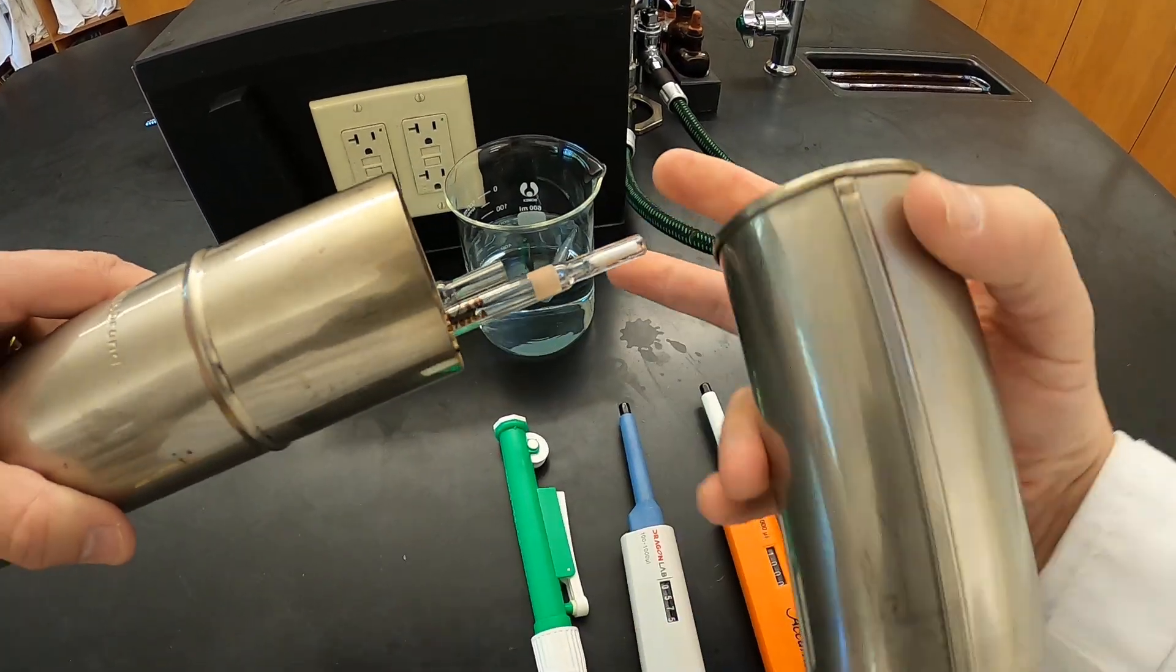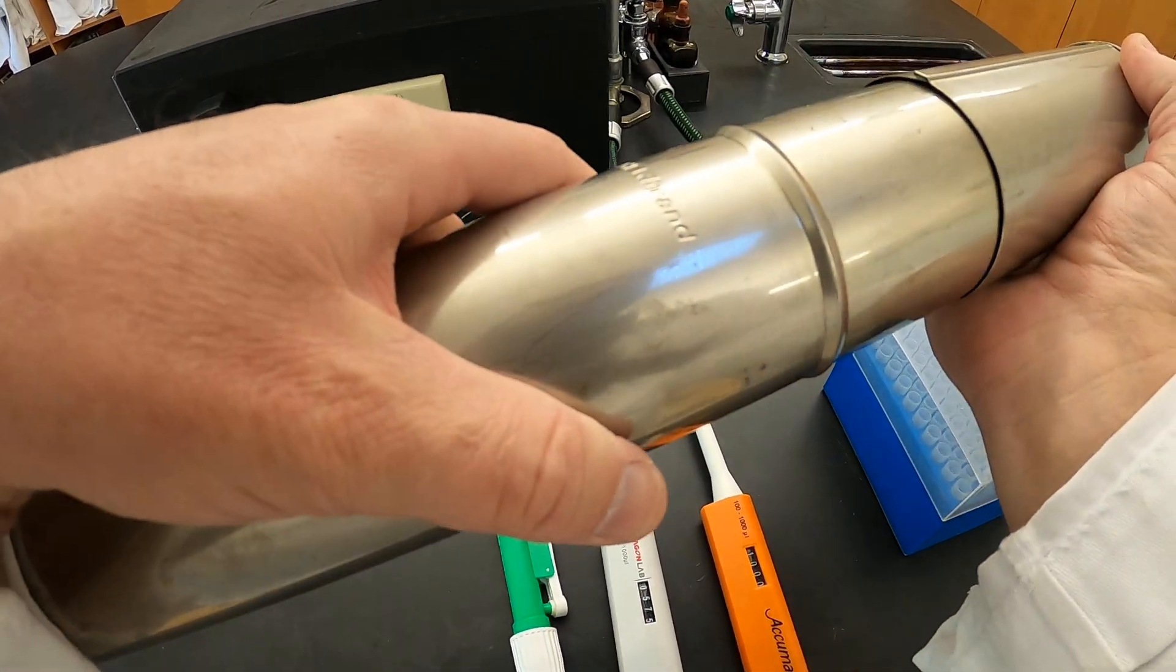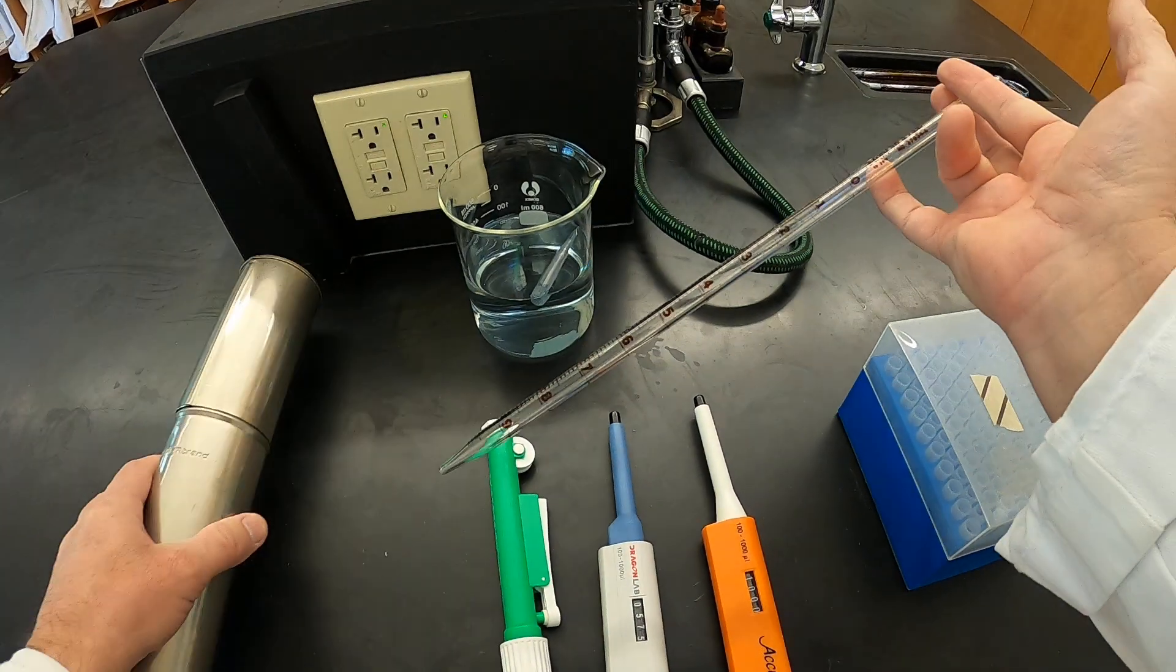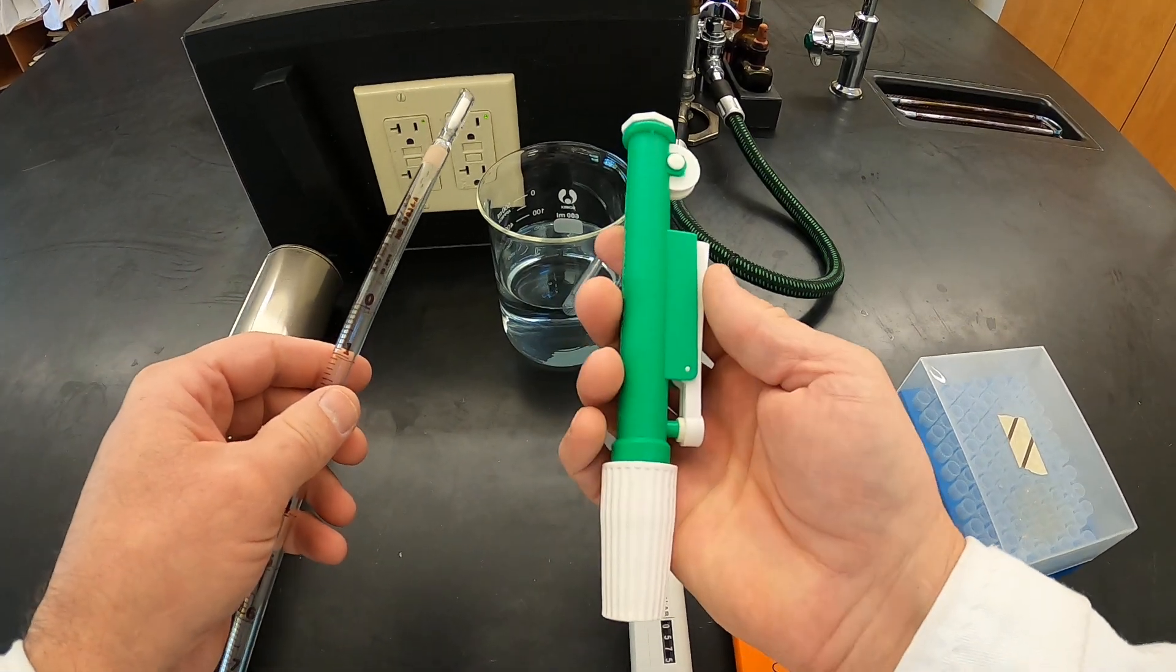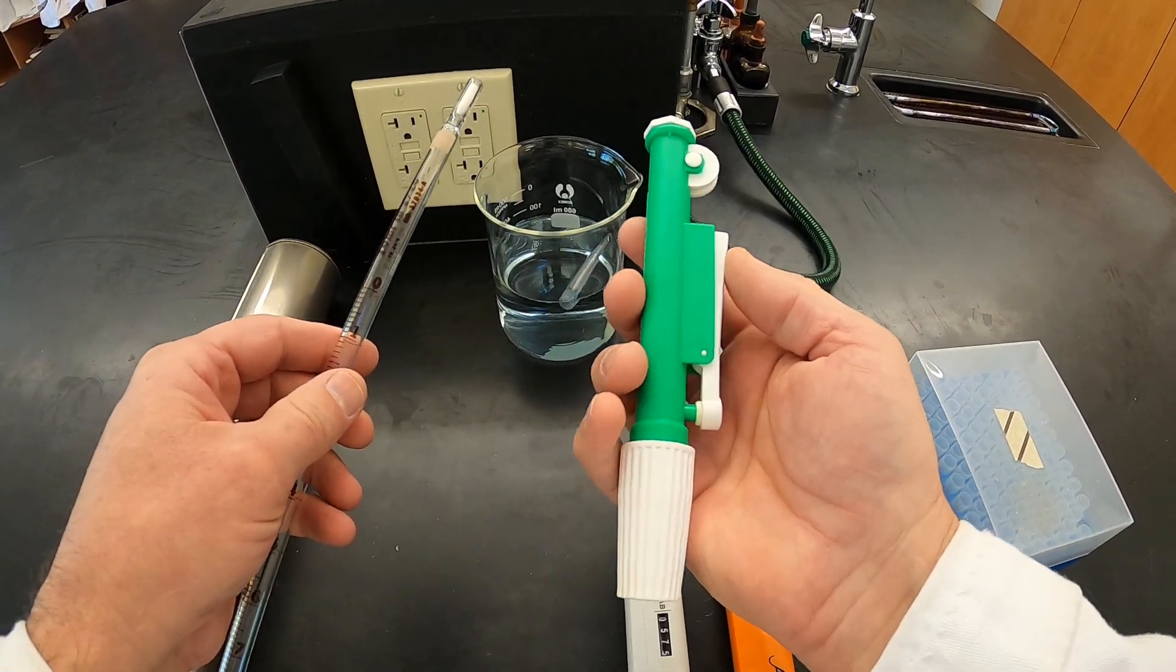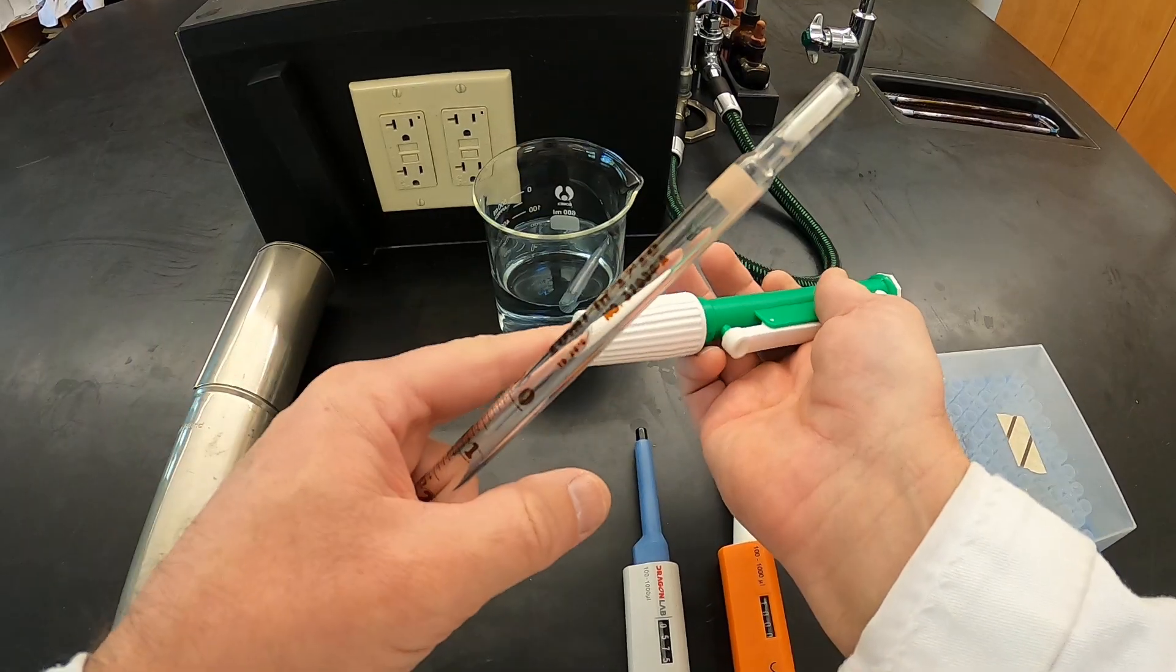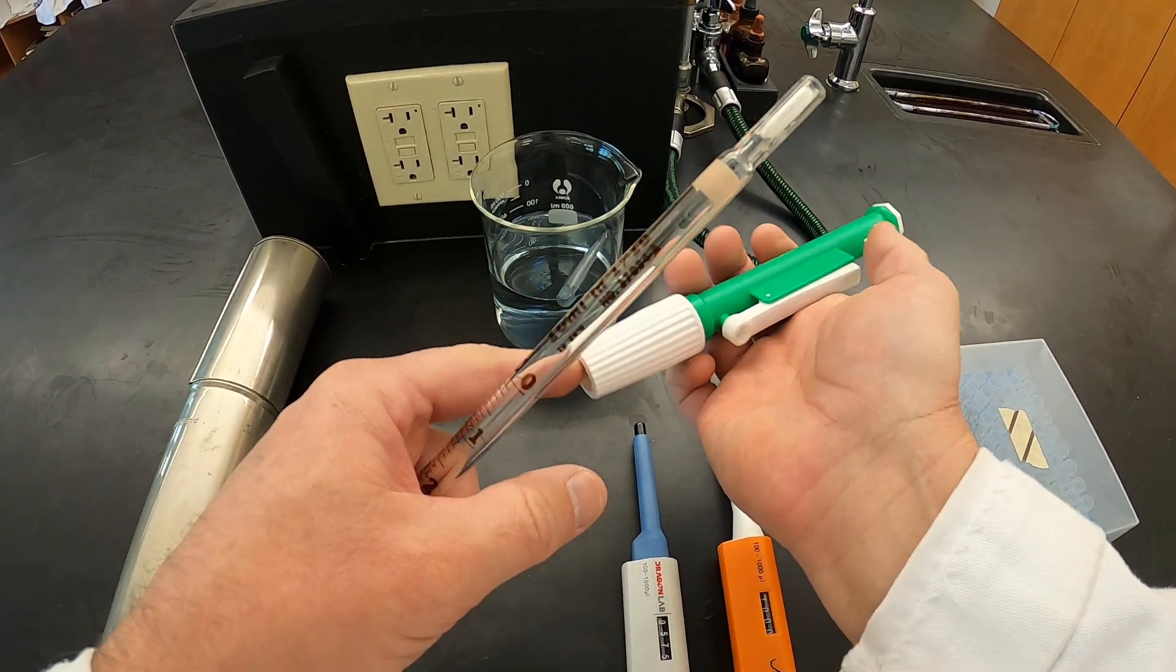Let's go back to our blowout pipette, and I'm going to show you how we are going to attach it to the pipetting device. So this right here is an example of a pipetting device, and it's got the end where we put the pipette in here.